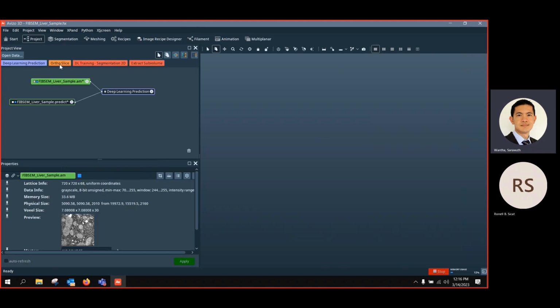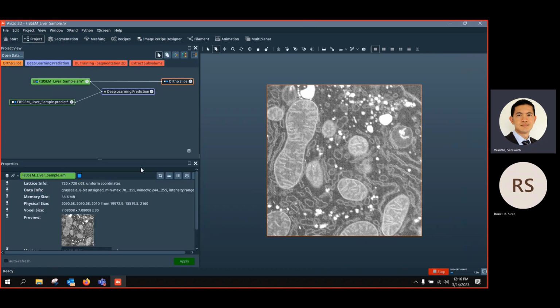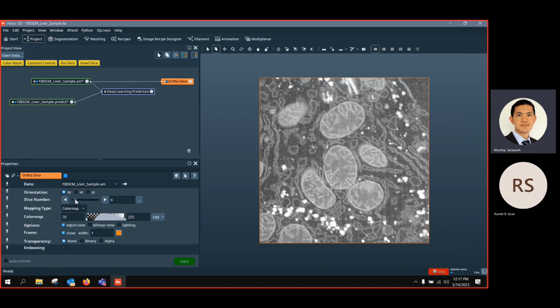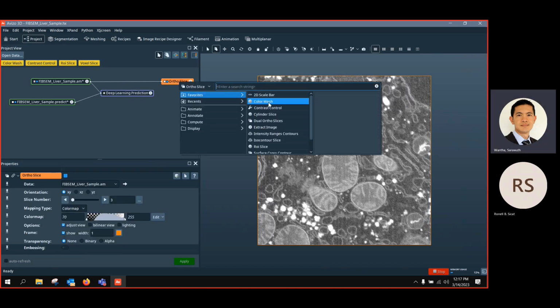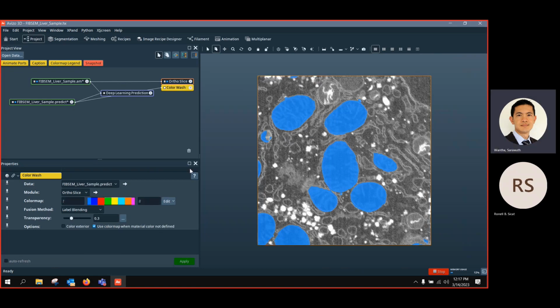If you look at the original data, we painted it manually. Actually, what we did is I painted it manually here, using the segmentation editor and the magic wand to draw, about 67 slices, which took maybe a few hours. Then we ran deep learning 2D, and you should get quite a decent result already from this training here.